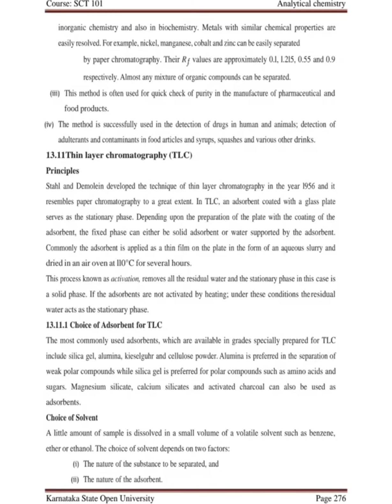Next is thin layer chromatography. This method is the same as paper chromatography, but the material used here is glass instead of filter paper.